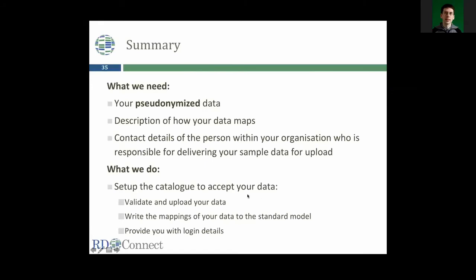And then what we will do for you is set up the catalog to accept your data. So that is, at least for the first time, validate and upload your data, write together with you the mappings of your data to the standard model, and also provide you with the login details so that later on you can also update your sample data by yourself, as long as you can provide the data in exactly the same format as you provided the first time.